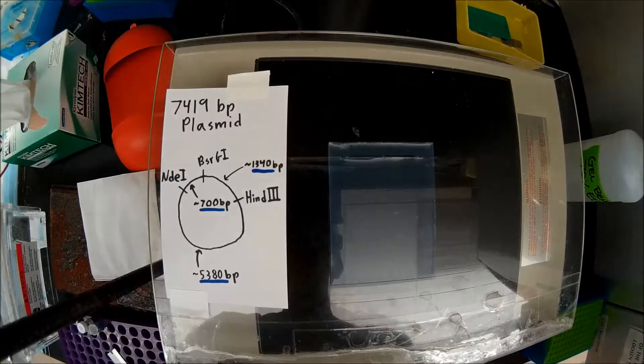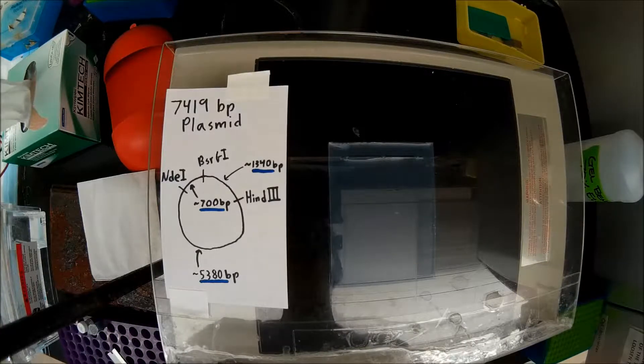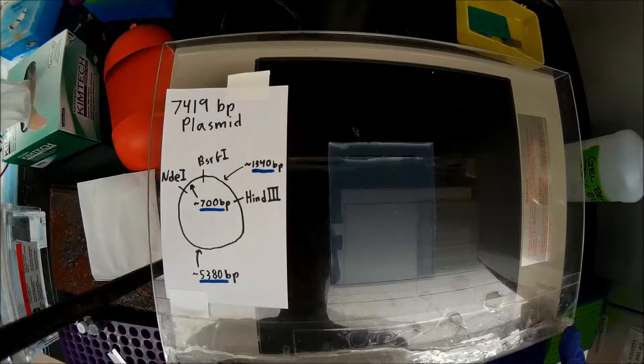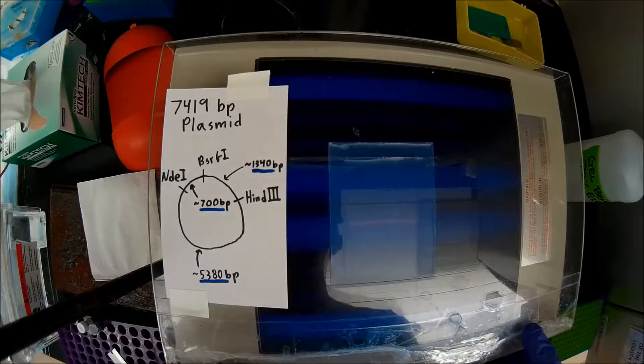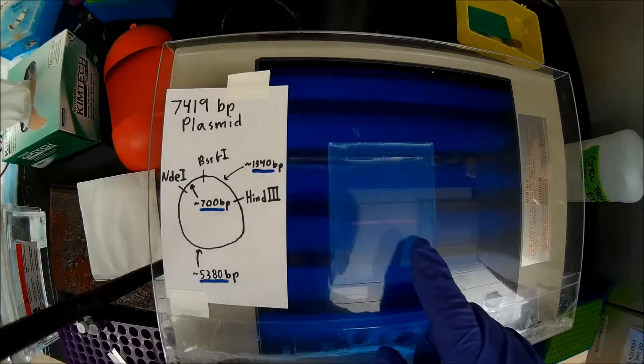Right now we're looking at our lab's UV transilluminator, which we use to excise bands from our agarose gels. When we turn this on, as you can see, our DNA fluoresces orange because we've added gel red to our gels.